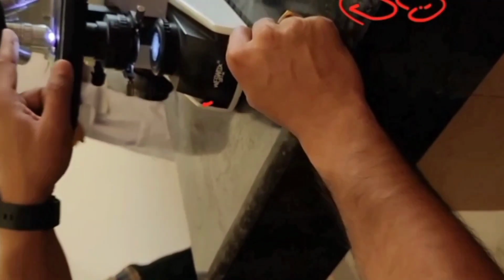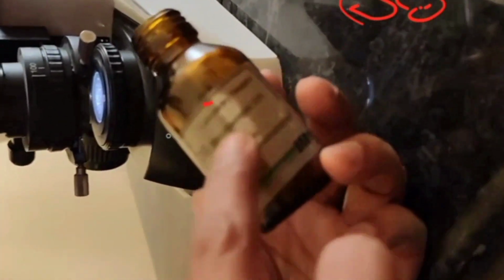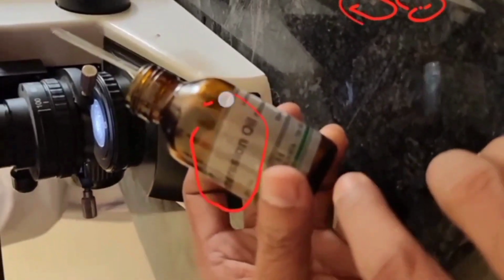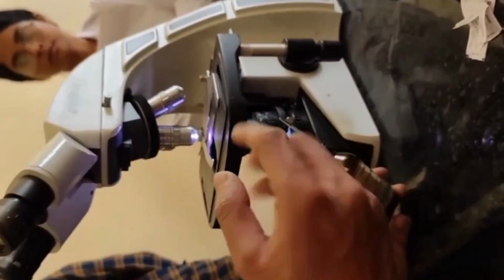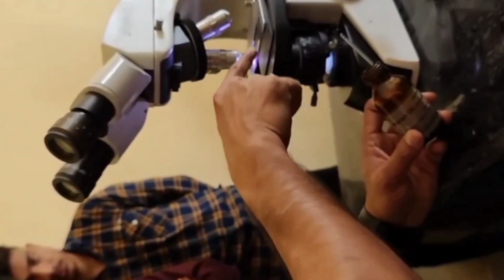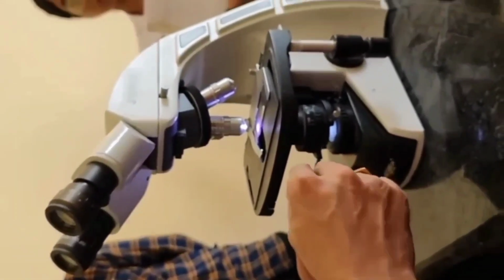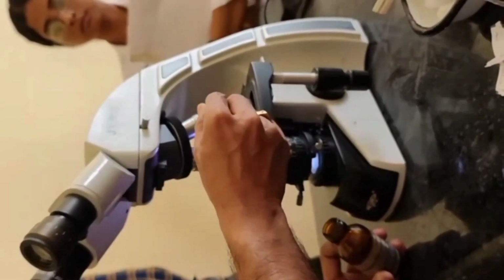So now I am going to move to the 100x. For that we have to use oil. So cedar wood oil is here. So we can see the oil here. Usually we use cedar wood oil. Other oils we can use are liquid paraffin or glycerin. Why can we use them? Because the refractive index is almost similar to that of the glass slide.